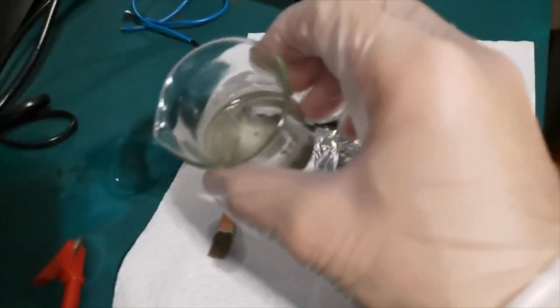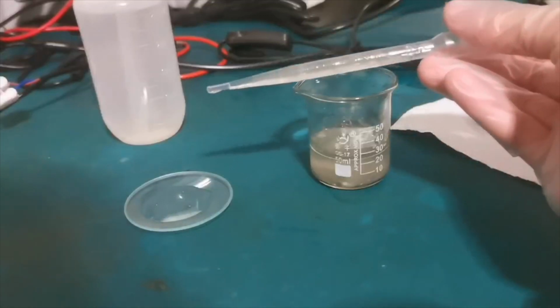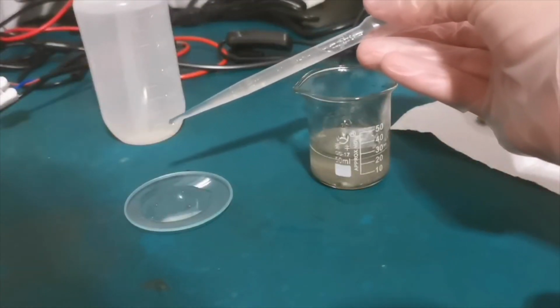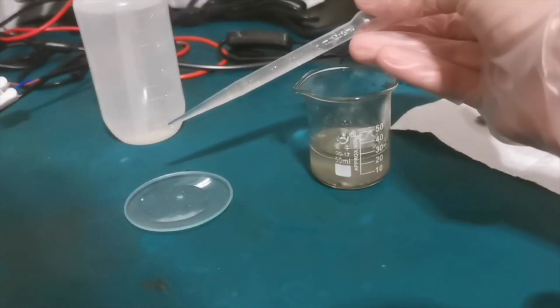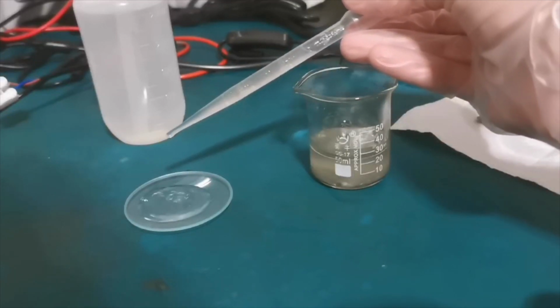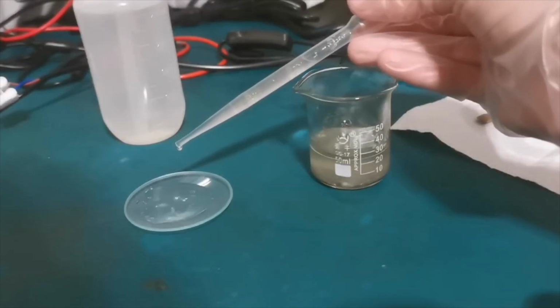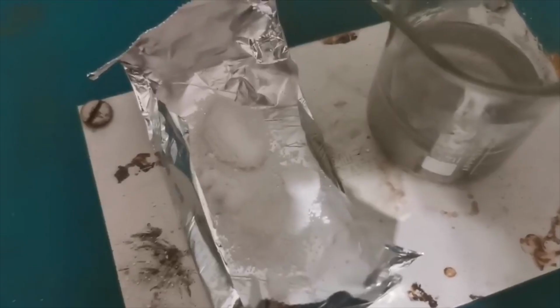When the electrodes were taken out, the electrolyte appeared slightly yellow, and some black stuff gathered at the bottom. I added some electrolyte in water to see if it would have a vigorous reaction, but nothing apparently happened, which means there is not much aluminum chloride inside it. This makes me feel sort of worried that the cell is taking way too much time to catch up to its supposed fast speed.